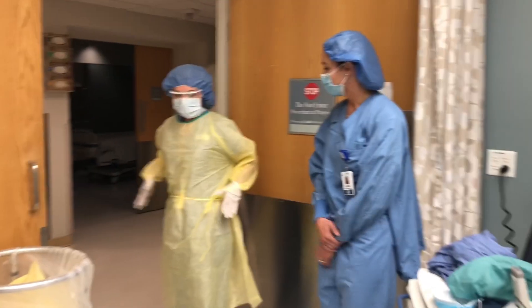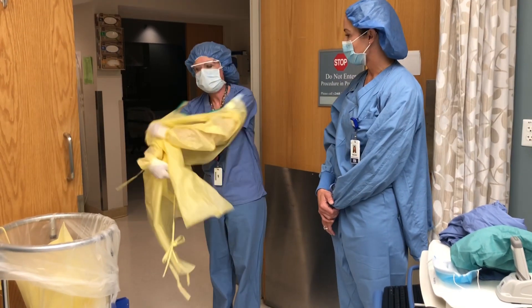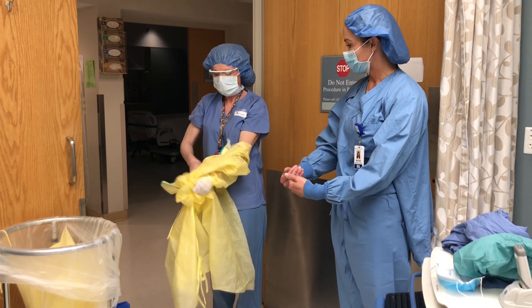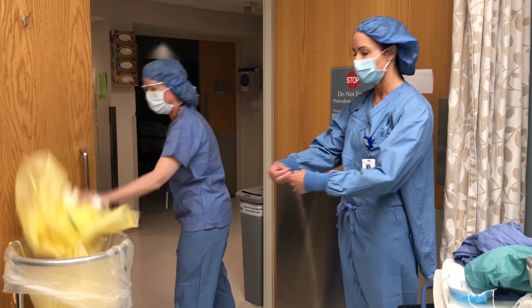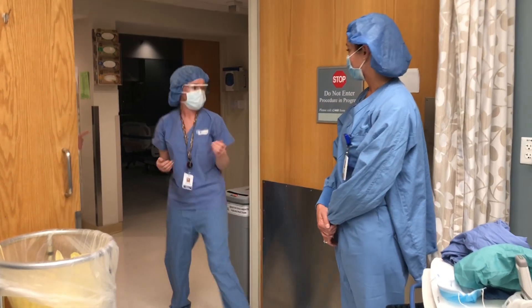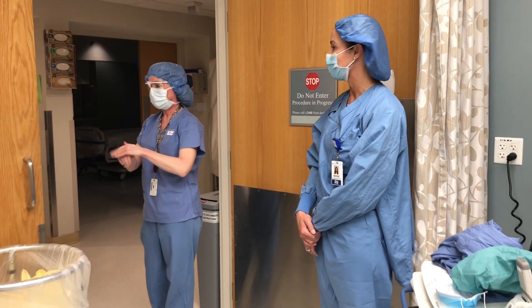So Melissa is going to start by taking off her gown. As she's taking it off she's kind of folding it in and taking her gloves off all in one, keeping the clean side away from the body. Next she's going to hand sanitize and apply a fresh pair of clean gloves.